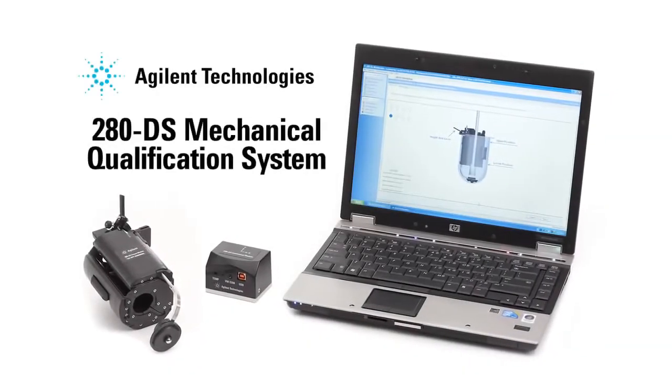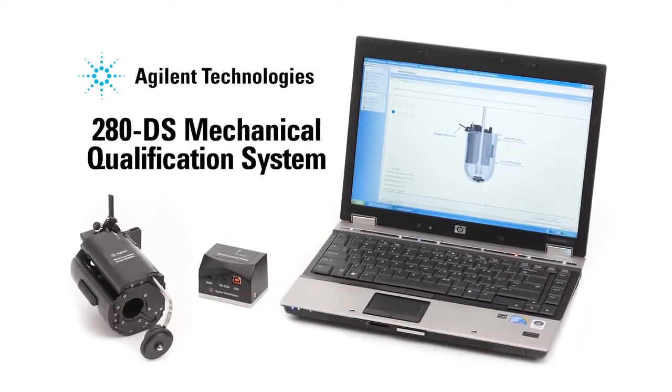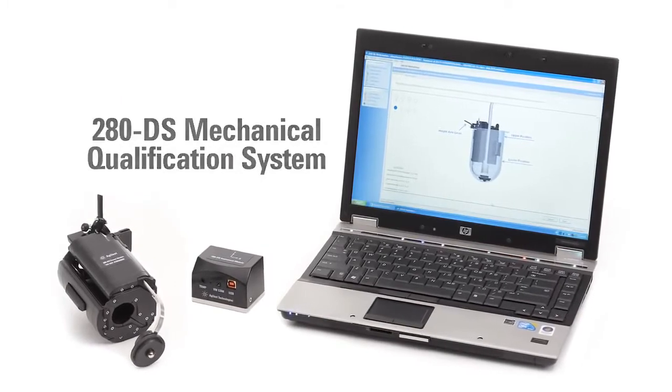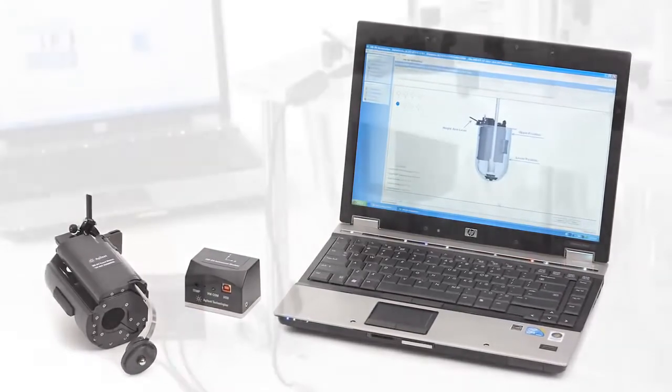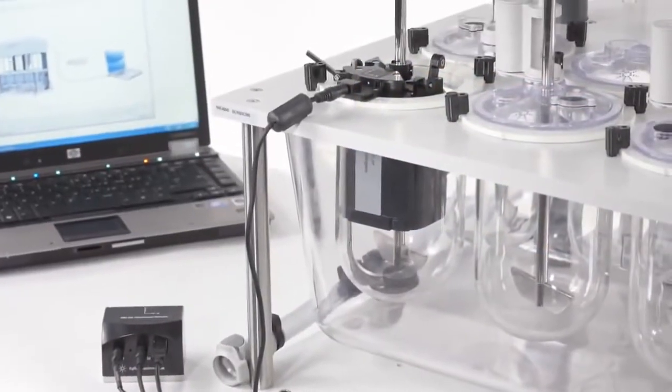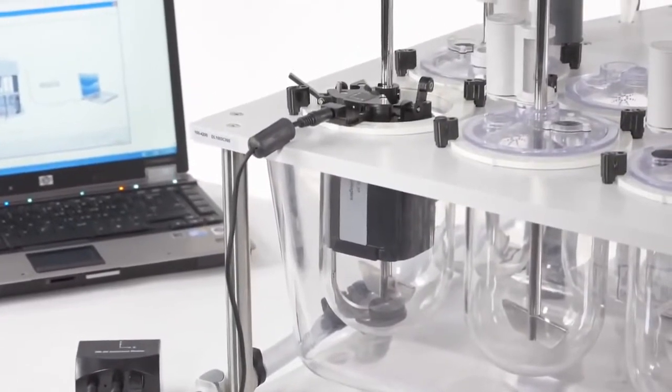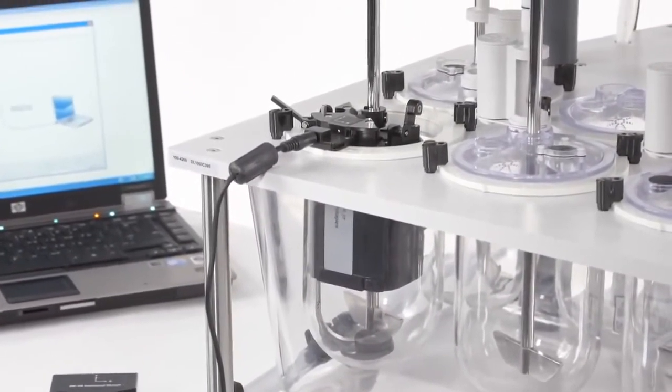The Agilent 280DS mechanical qualification system redefines dissolution qualification by measuring critical physical parameters of dissolution apparatus with unmatched precision.